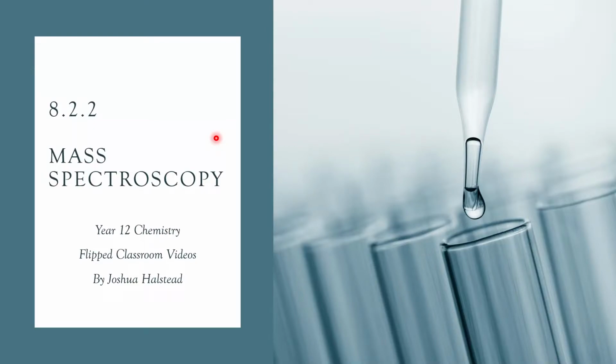G'day chemistry students. In this video we are looking at dot point 8.2.2 again. Our focus is going to be on mass spectroscopy, so a slightly different spectroscopic technique which will allow us to learn a little bit more about our unknown chemicals.